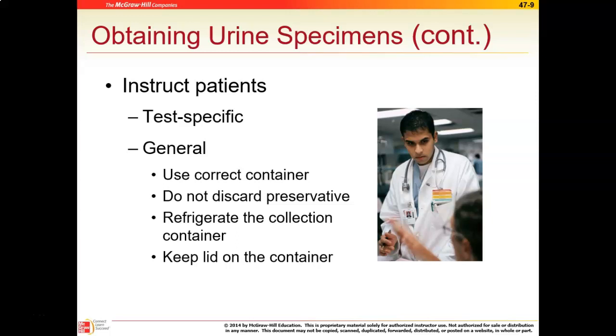Some of these containers will have a powdered or a liquid preservative within the container in order to preserve the urine for the time frame until the test is done. And so you always want to let the patient know that if that particular container comes with a preservative, not to dispose of it, okay?